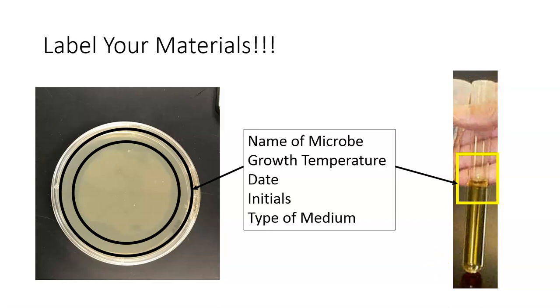Now, let's watch a video on Aseptic Technique by Biorad together. The demonstrator in this video is subculturing bacteria, and it's going to do a number of different subcultures.